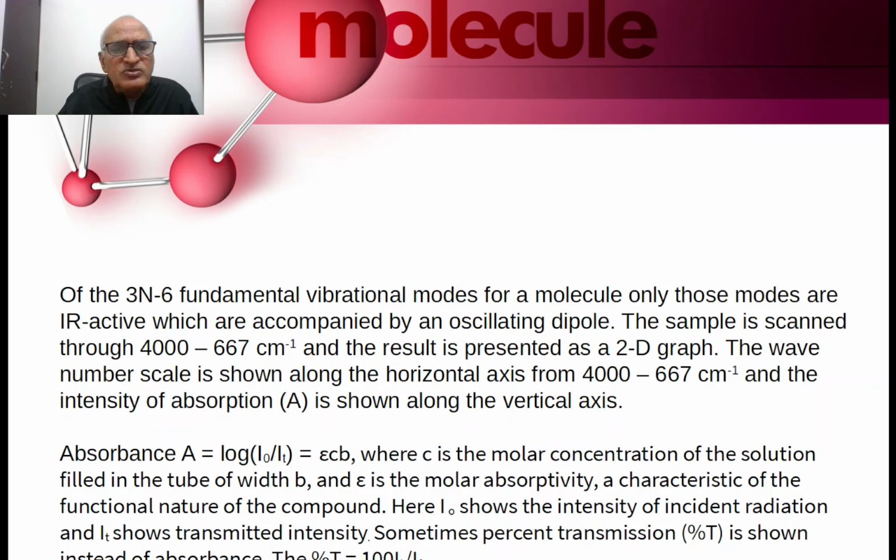For infrared spectrometry, we generally don't bother much about the concentration and the Lambert-Beer law because we are interested in having a qualitative spectrum from which functional groups can be identified. So these things I have just narrated because they are useful. The concept should be known.